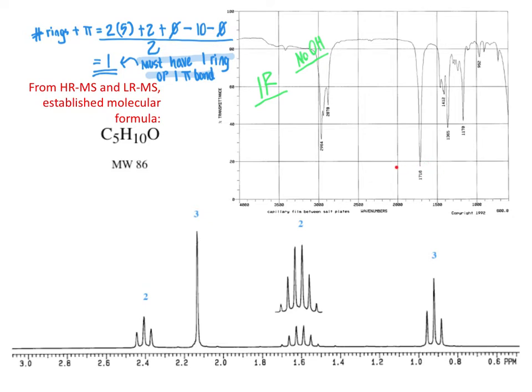It's a very deep signal, which is very diagnostic of carbonyl groups because carbonyl groups are usually the strongest or close to the strongest signal that we see in the entire spectrum, and they will be in that range of around 1700. And so that indicates to us that we have a carbonyl group within the structure of this molecule. And I'm going to highlight that so that I keep that at the forefront of my mind.